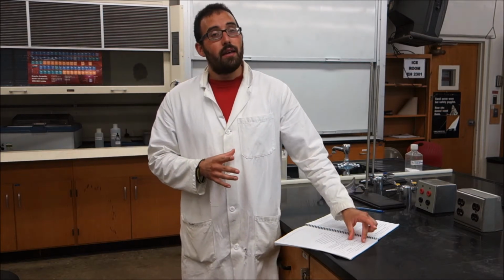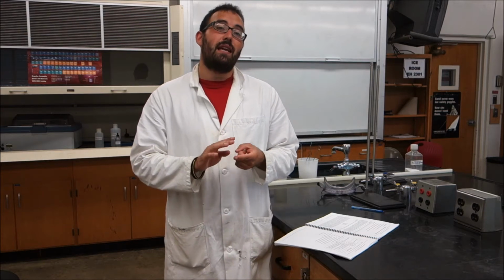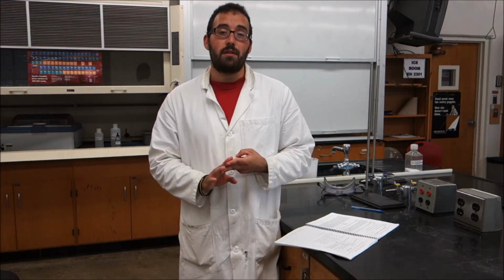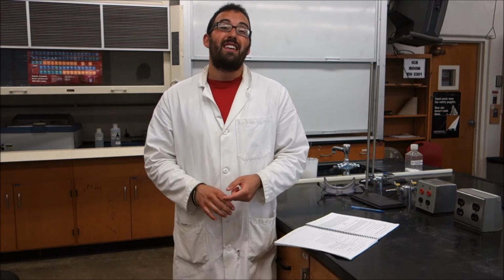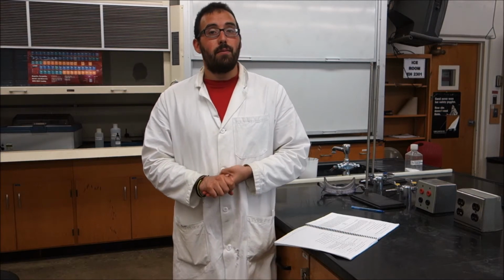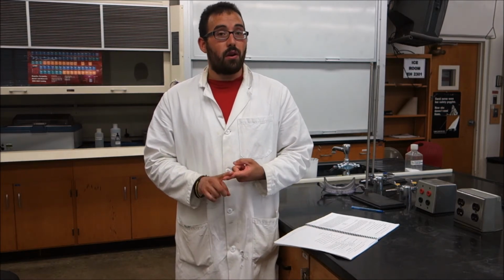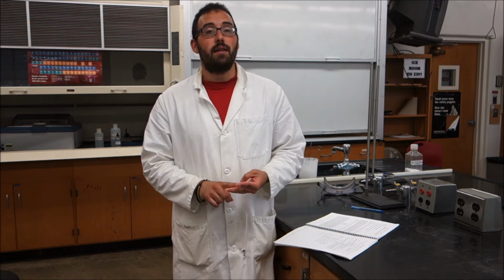Now, if we look at the top half, you have nitrates and acetates, which have no exceptions. So the column on the right of that table is telling you that there are no exceptions to any nitrate or acetate containing solutions. So those are always soluble. Now your halides, chloride, bromide, and iodide, are typically soluble unless it's with one of 3 heavy metals, that being silver, mercury, or lead. If it's a sulfate, it is also typically soluble except with the 4 exceptions listed. And those are strontium, barium, and again, mercury and lead.